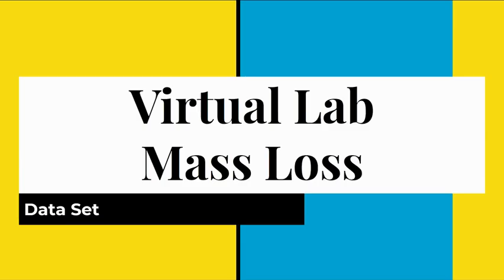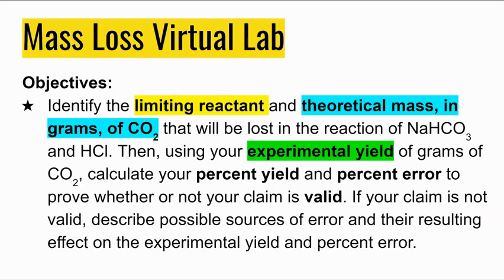Welcome. This podcast is going to be the virtual lab for our mass loss lab in chemistry. From this podcast, if you were absent, you will be able to get a data set.